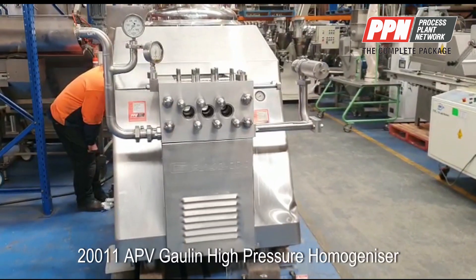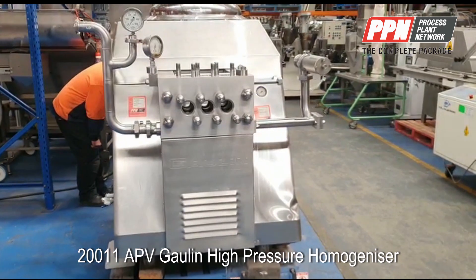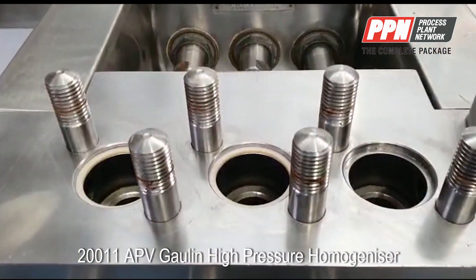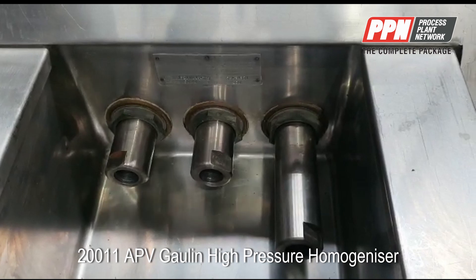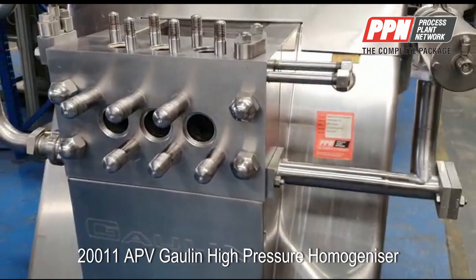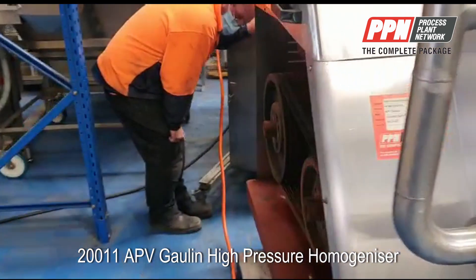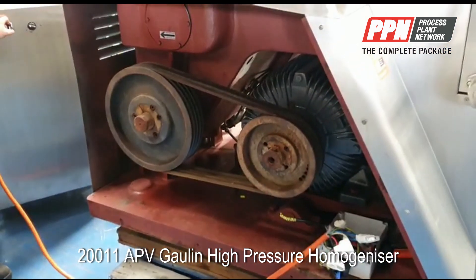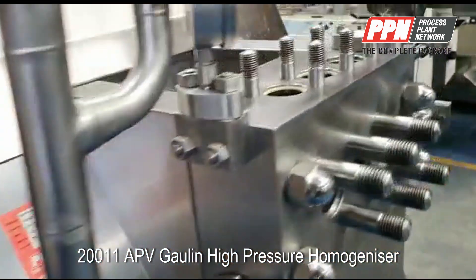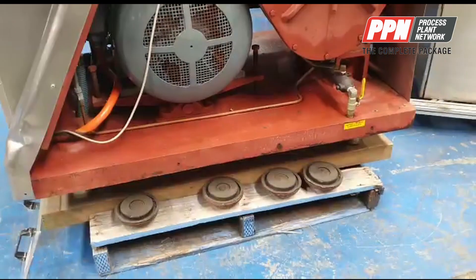We're looking at an APV Mantengorlin MC18 homogenizer. We've removed the pistons so that we can run the machine dry for you. We've also removed the first and second stage homogenizing block, and we've temporarily wired the unit so that you can see it in operation. And there are the vibration pads.